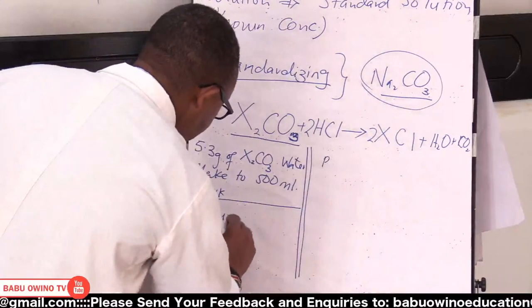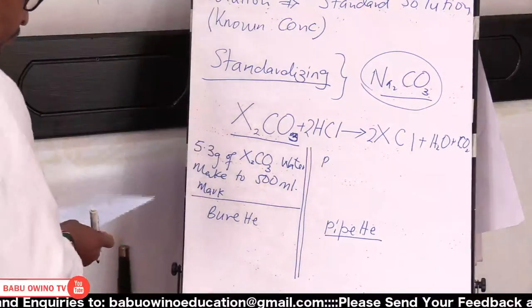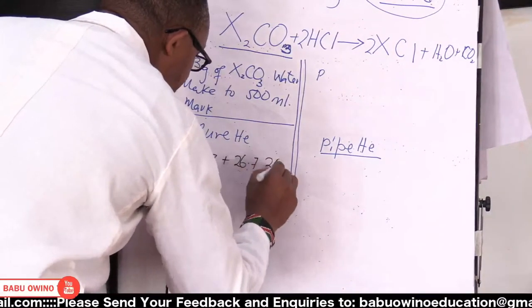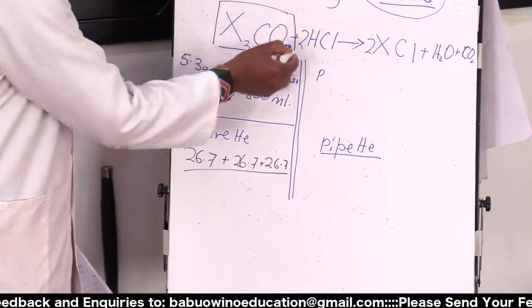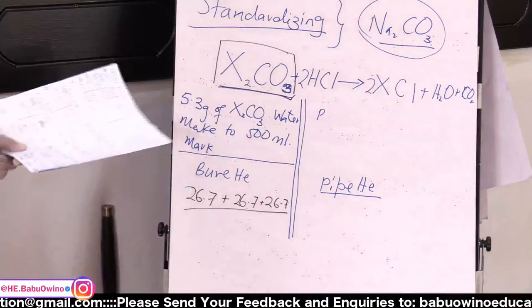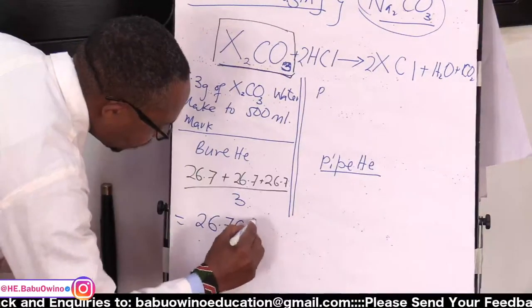Let us now have the burette here, and let us have the pipette here. My volumes in the burette would be, let's say, here I take 26.7. So what is the exercise here? The examiner is now interested in working out the mass of this. After we work out the mass of this, we'll get the mass of X. These are theoretical values. So in this case, I got 26.7, 26.7. I will average all of them, and therefore the volume in the burette is 26.7 cubic centimeters.